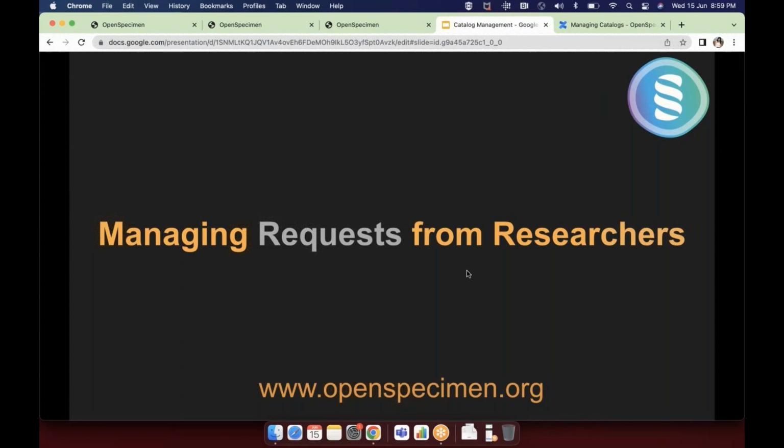That is one more use of it. In your biobank website, you can say, to access specimens, use this link to look at the summary data, and that will directly take you to the catalog. And of course, if you want to make the URL public, that is outside your network, all that needs to be taken care of by your IT. But in general, without login is what the public catalog means. So all that is configured.